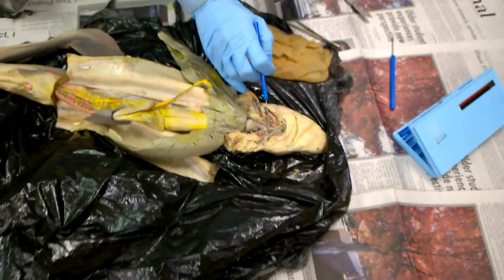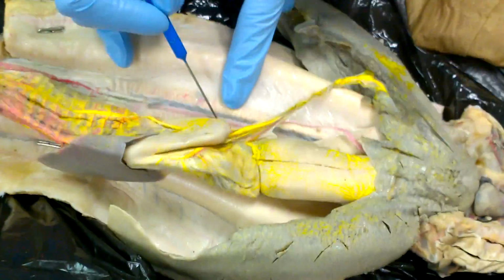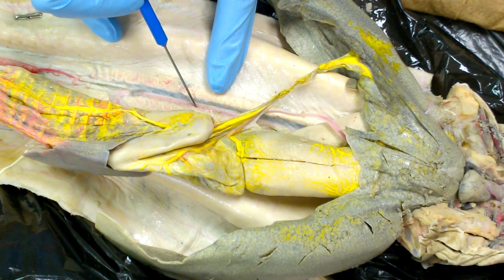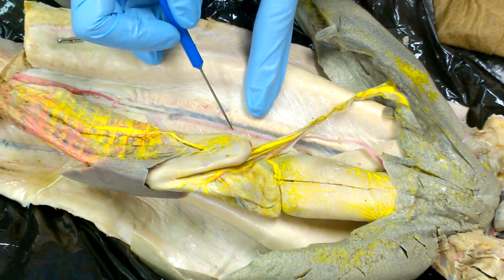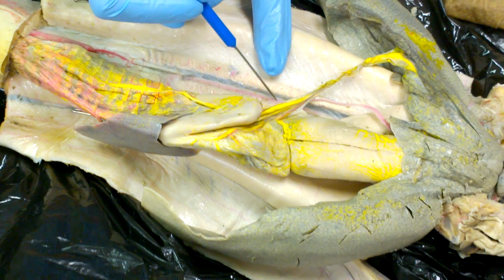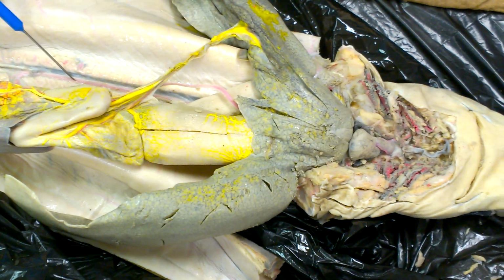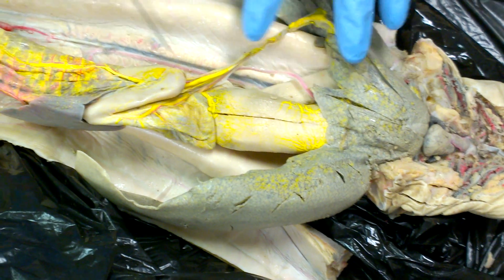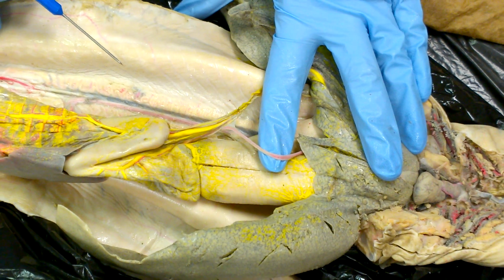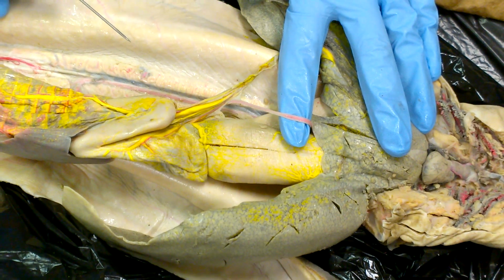Okay, so the ventral aorta is coming out of the heart, and then the dorsal aorta is right here, running essentially from right here all the way down on the dorsal side. It's in between the kidneys, and then the mesonephric duct is on top. So what was this? Dorsal aorta. And what comes together to form the dorsal aorta? The efferent branchial arteries. Perfect. So the first branch of the dorsal aorta that we can see is this one by itself. The hepatic. No. It starts with the C.